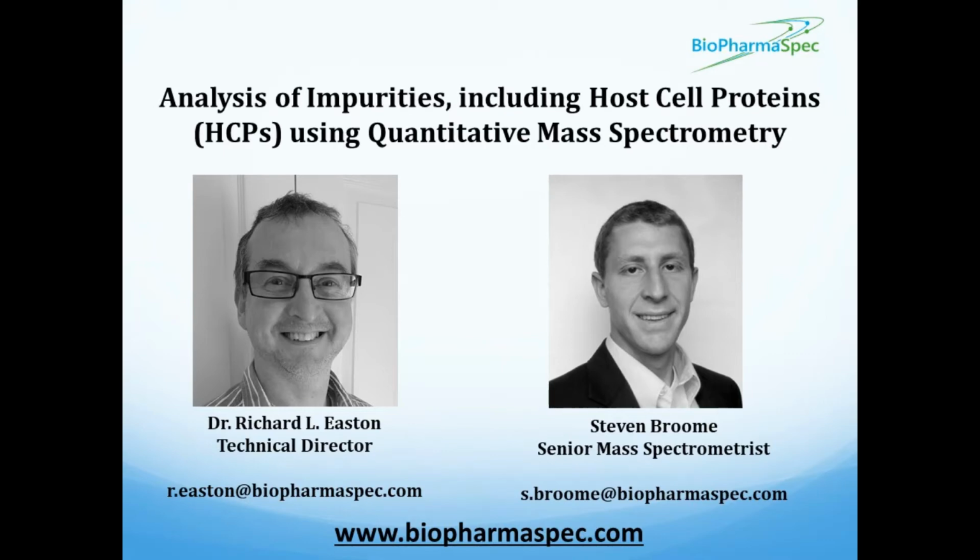And these adverse effects can be caused in some cases by really low ppm amounts of impurities. For all of these reasons, it's really important to monitor impurities and use that knowledge to feed back into your production process with the goal of minimizing and reducing impurities wherever possible. And a final point on why it's important is that the regulatory authorities are expecting that impurities have been checked for as a crucial part of the product characterization process.